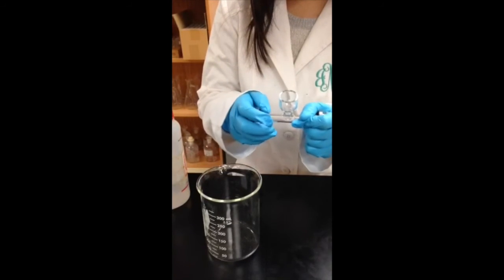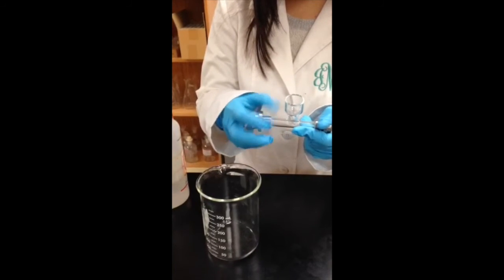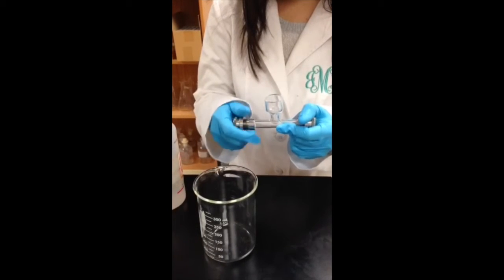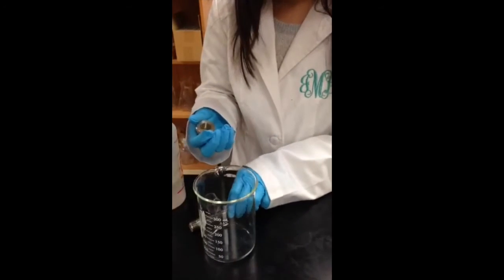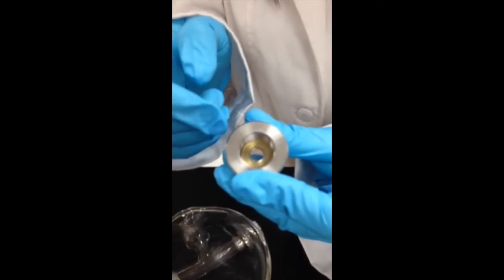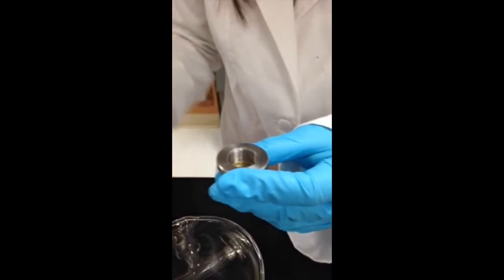First, take the ends apart by unscrewing one at a time. Inside the end, there is a piece of glass. Make sure you do not drop it.